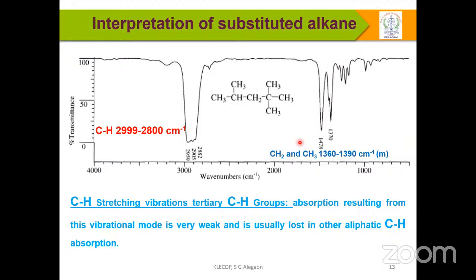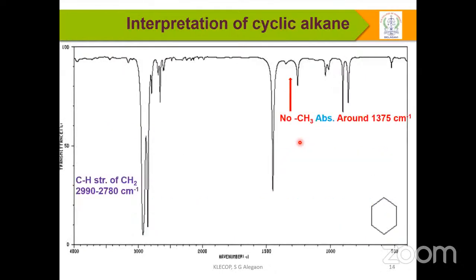But when you compare to a plain chain, these branched ones are a little bit weak in concentration. Let us now see a cyclic compound. Now you understand the difference between plain and branched. Now we are going to understand how a cyclic alkane looks.